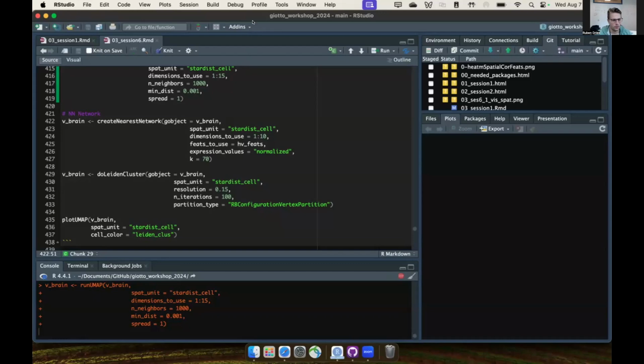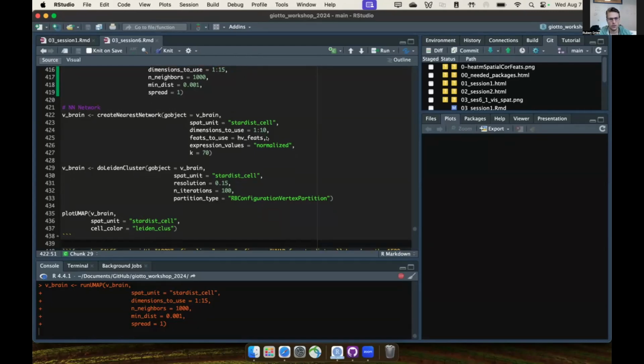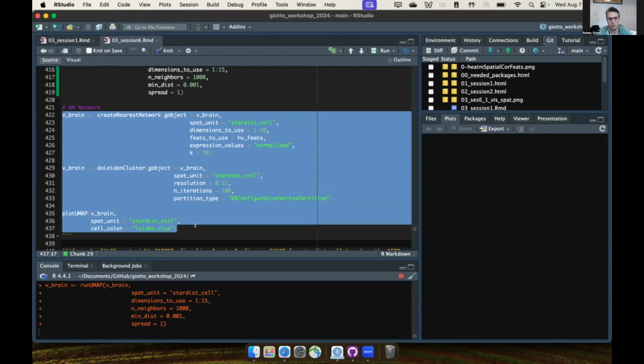I just want to add something now that we're all waiting. I think this is pretty cool, and we show what it can do. The reality is that we can easily integrate our Giotto Suite framework with the long-standing R spatial data science ecosystems that have been around for decades. There's actually a lot more you can easily do right now with these new technologies.